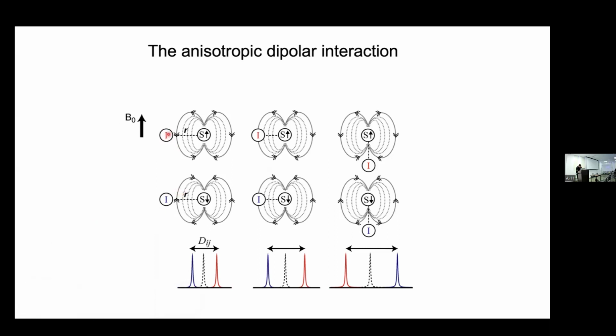So here the nitrogen experiences the local field from the neighboring proton, which is opposing the magnetic field. And so it's causing a reduced effective field at the spin, and as a consequence, it resonates upfield a little bit because of that local field. Whereas in the situation where the proton neighbor is in a beta state, it's pointing down, and then the magnetic field now reinforces the magnetic field, so you have a little bit of a downfield shift to the resonance. And so the local field at the nucleus changes as a consequence of the local magnetic field.